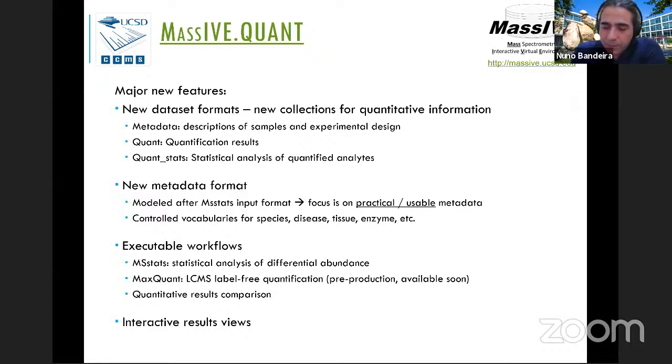Both would be welcome. In some cases, we have DIA data analyzed with DIA-Umpire, and that's an example where we have both. We would have both the original SWATH files as well as the deconvoluted MS2 files. And it outputs more than one. All of those can be submitted in separate collections. When a data set is submitted, there are different subsets of the data. There's a collection for raw data, and then there's a collection for converted files in open or standard formats. That's where the converted and demultiplexed data would go, with the raw data going in the raw collection.